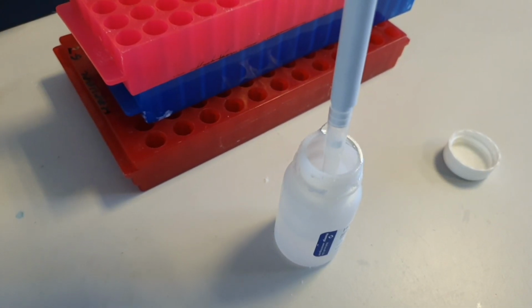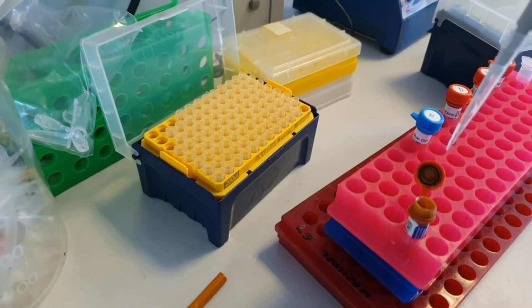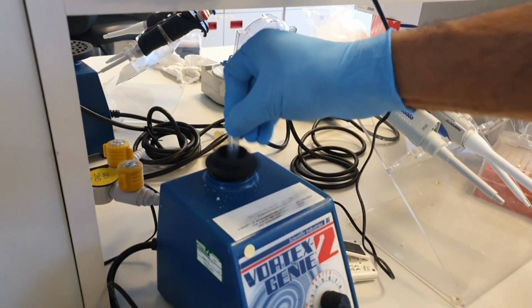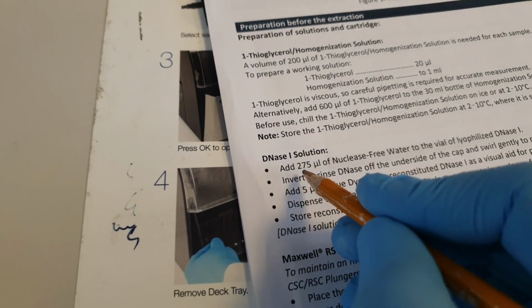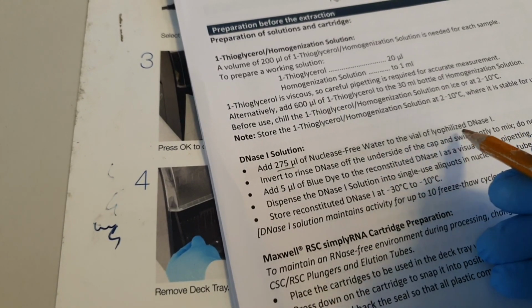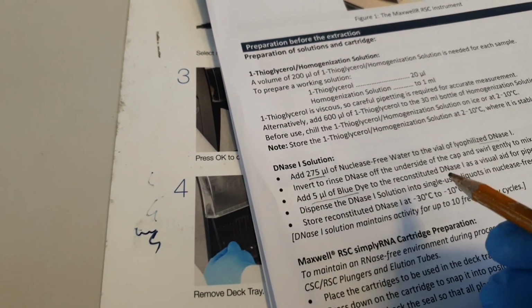To make a working solution of thioglycerol, I'm taking 980 microliter of homogenization solution and 20 microliter of 1-thioglycerol. Briefly vortex. The DNase solution is already prepared and was kept in the freezer. It was prepared by adding 275 microliter of water to the vial of lyophilized DNase that came with the kit, and then adding 5 microliter of blue dye.